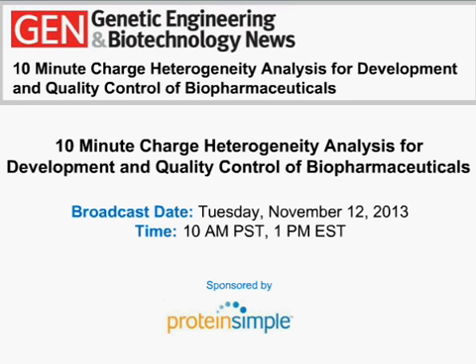It's entitled 10-Minute Charge Heterogeneity Analysis for the Development and Quality Control of Biopharmaceuticals. Two of the most critical steps in protein characterization and biotherapeutic development involve the determination of protein isoelectric points and charge isoforms. These factors play key roles in biological activity and drug stability. Thus, they can also be considered potential make or break points on a product's path to commercialization. Today's webinar has been designed to help you carry out these analyses more efficiently, effectively, and accurately.